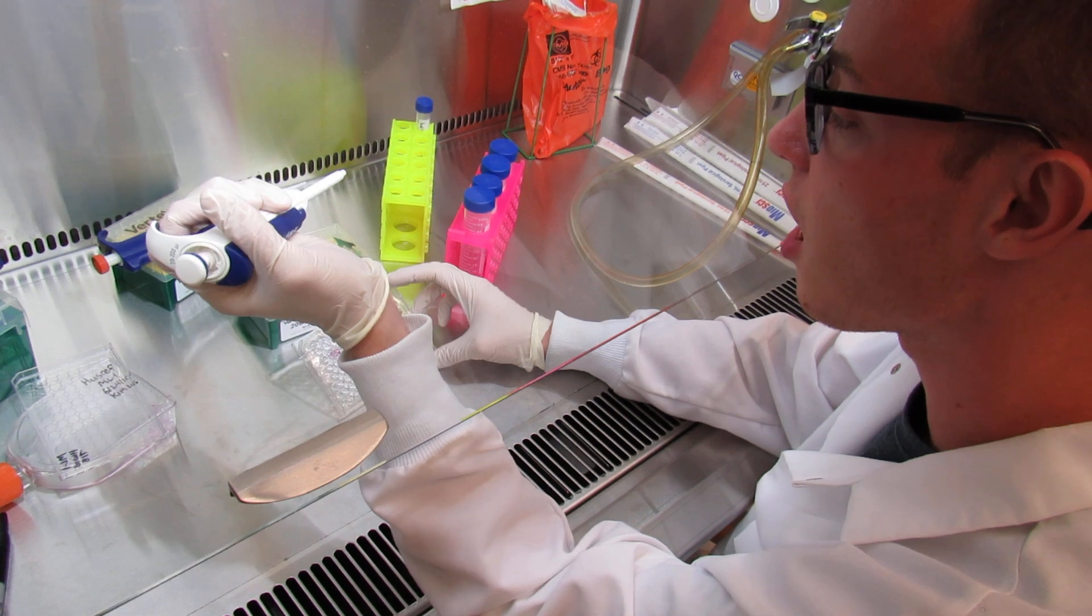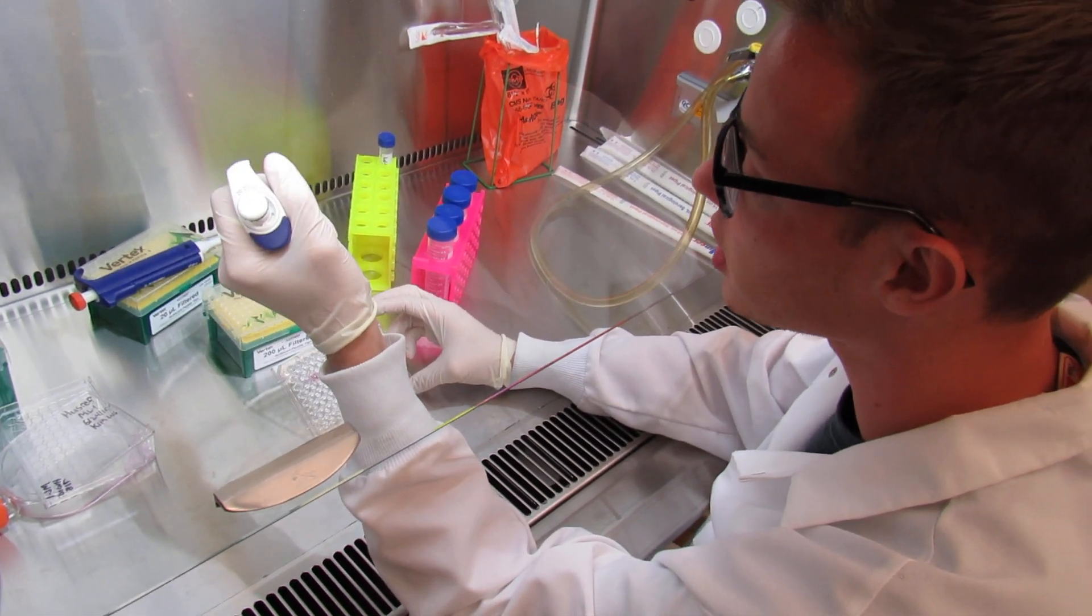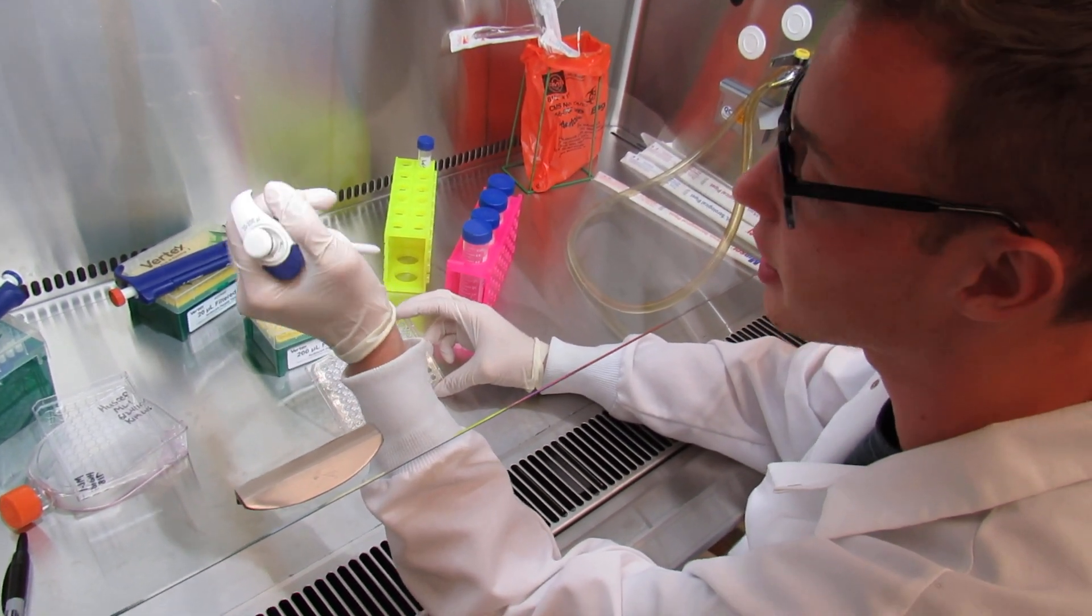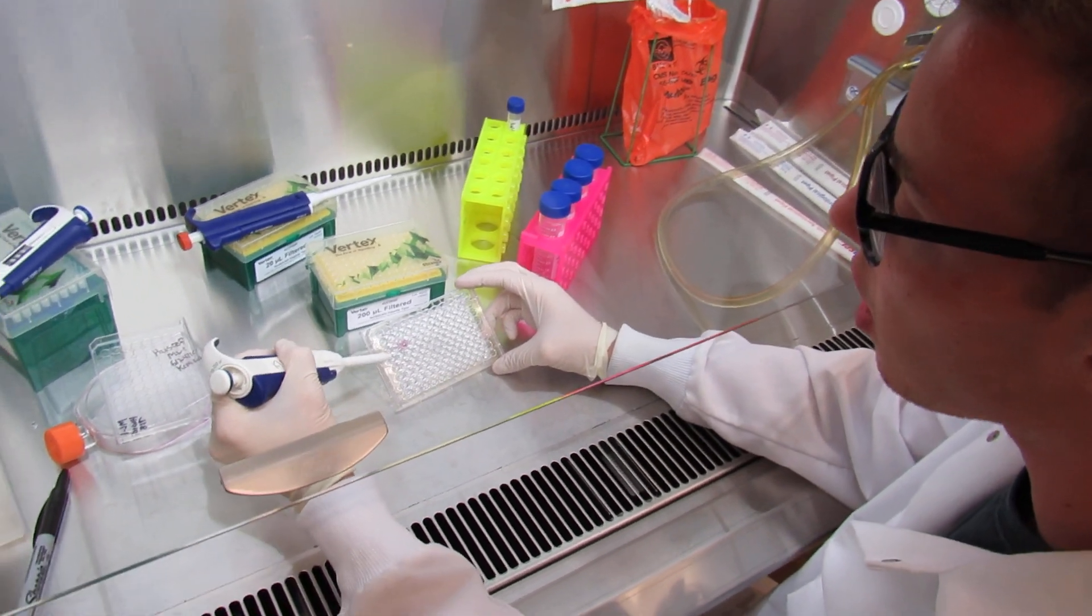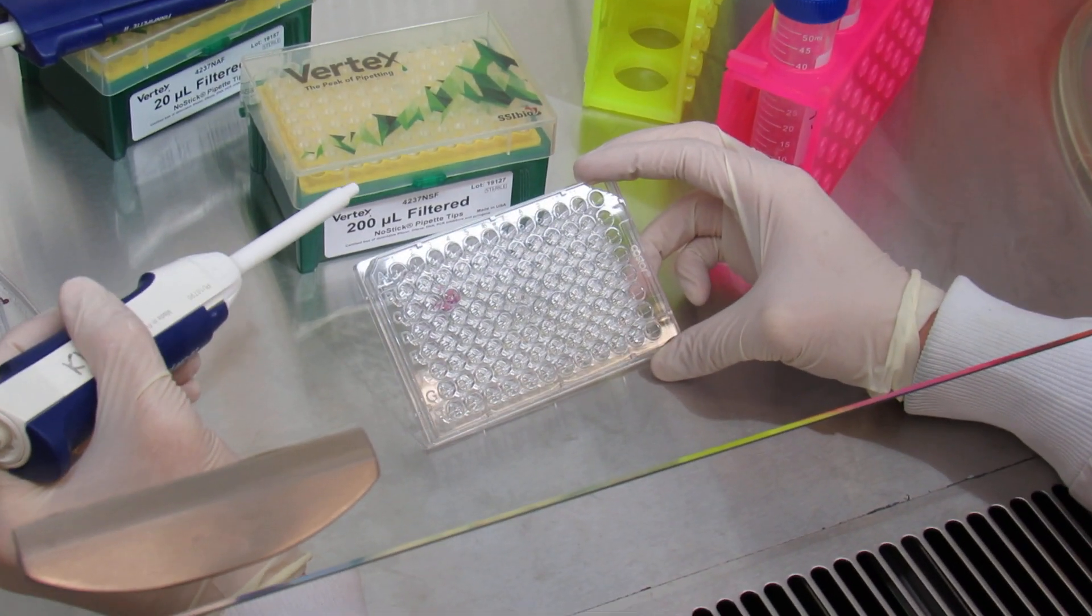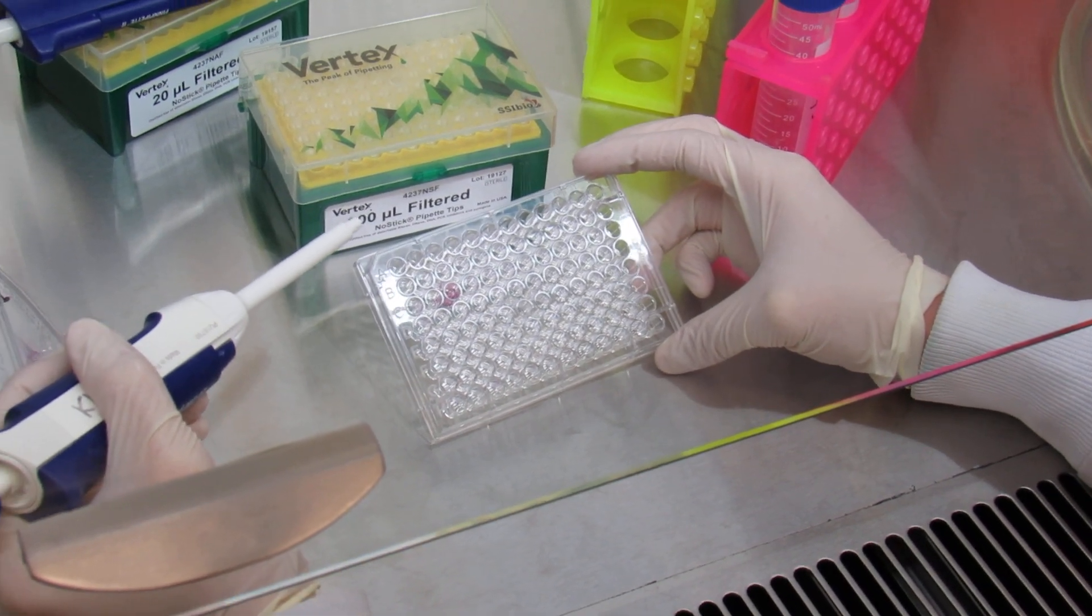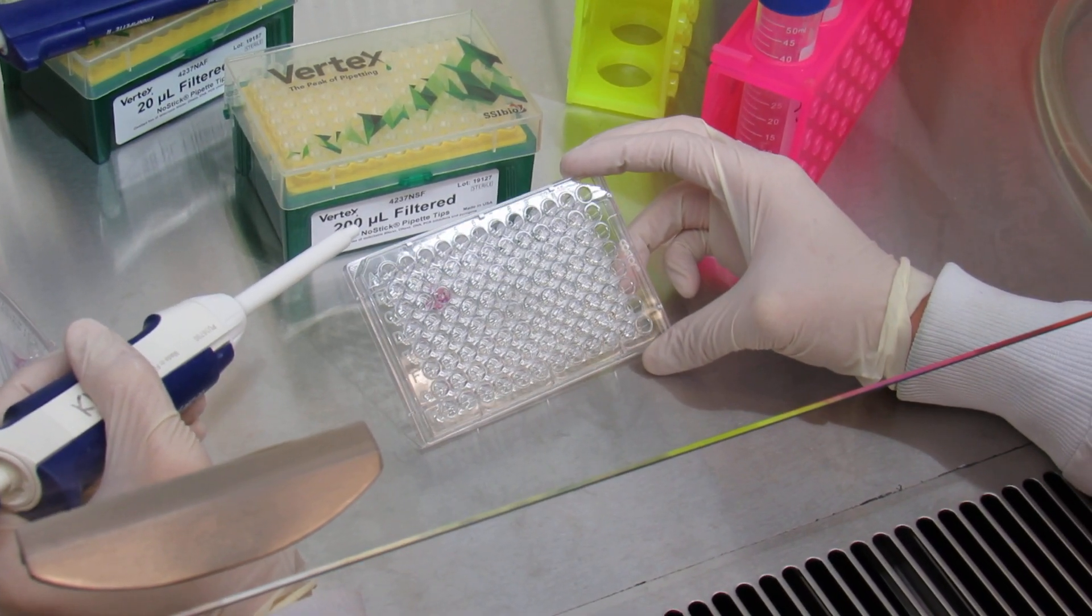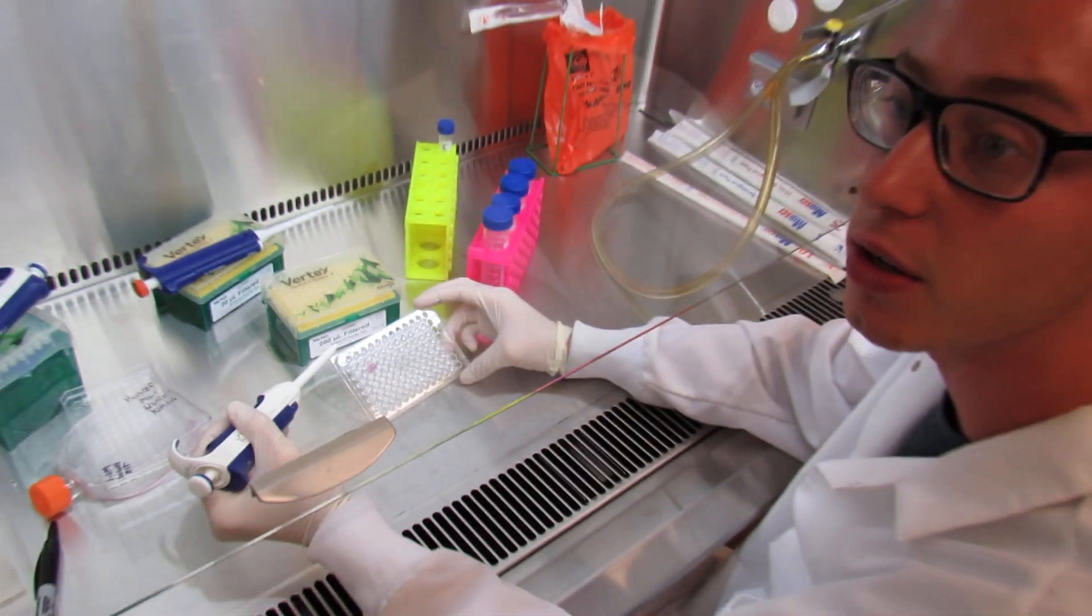You're ready to seed all of your wells and then once you're done with that, you will add 100 microliters of PBS into all of the adjacent wells to avoid evaporation. And then you're able to put it in your incubator for 24 hours to attach at 37 degrees Celsius and 5% CO2.